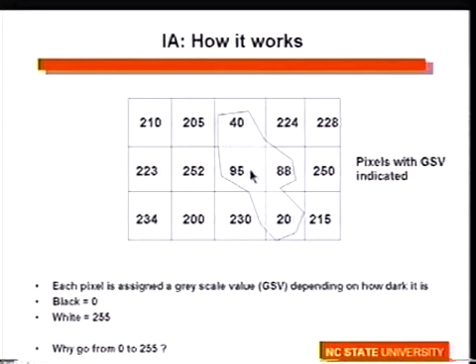However, on average, this is going to make the particle somewhat smaller, right? Because we can have 100% pixel coverage, that's not going to make it bigger. But on the edges, we're going to have a border of white and black, and that's going to make counting this as a dirt particle maybe more dubious.